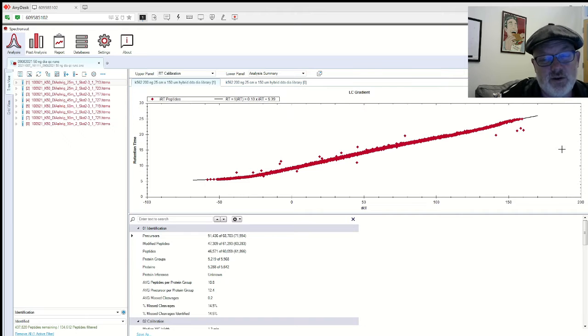You can think of this as goal posting. It uses a deep learning algorithm that's much better than the algorithms people used 5 or 6 years ago to take the sequence of peptides and predict what the retention time is going to be. But because they don't know what our gradient length is, it has to convert it into an IRT space. It takes the peptides that are known to be most hydrophobic, eluting most late in the run, around 25 minutes of the 30-minute total, and gives them a number. Really hydrophobic peptides are going to be like 160.